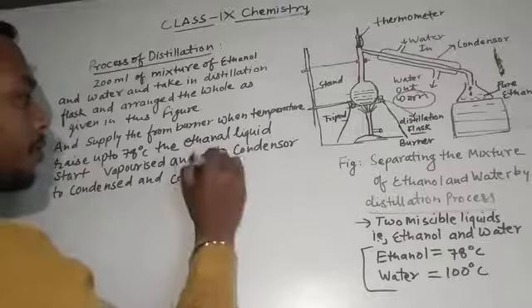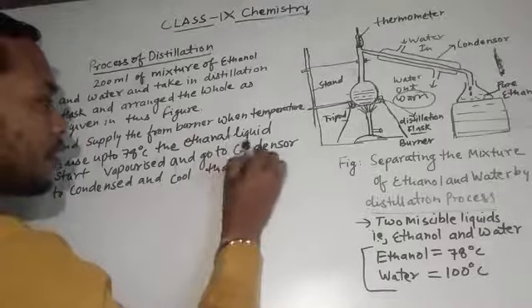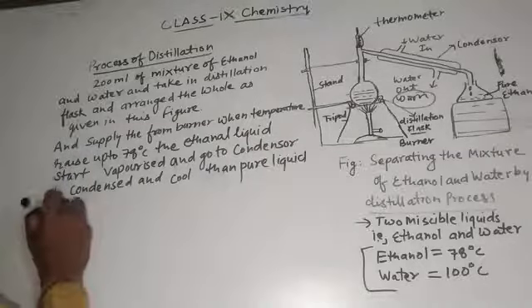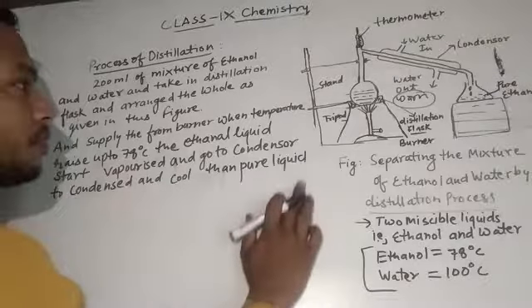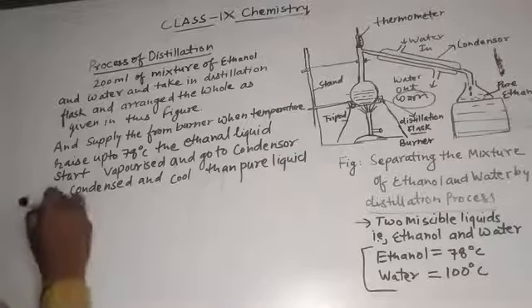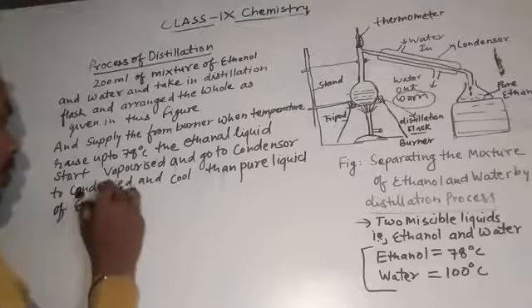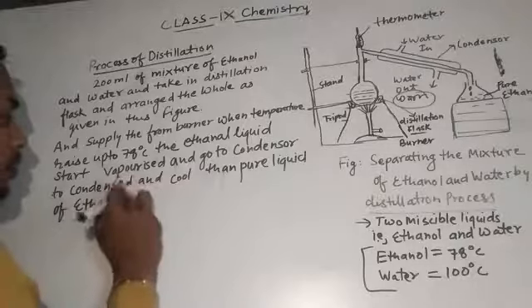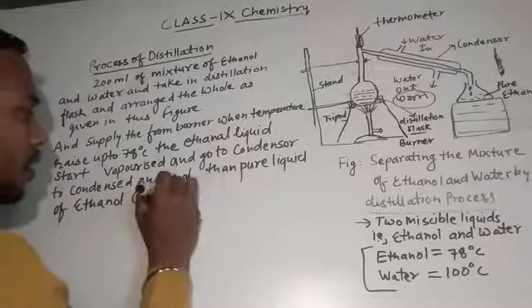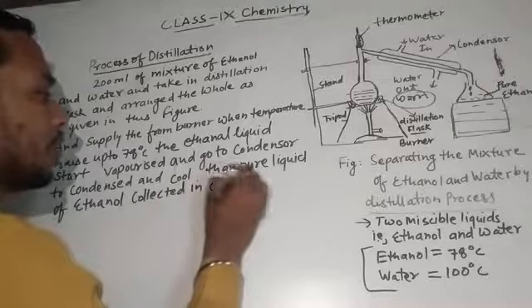Then the pure liquid of ethanol is collected in the collecting vessel.